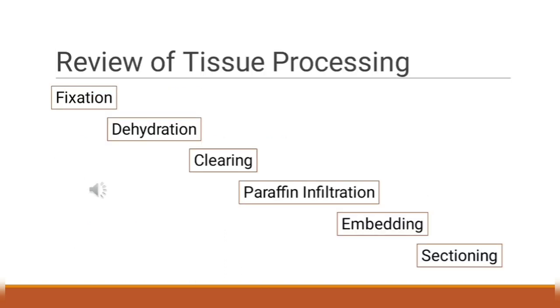This is just a review of our tissue processing steps. First we have fixation, second is our dehydration. We also have clearing, paraffin infiltration, embedding, sectioning, and our staining. So decalcification also is an exception rather than a rule.